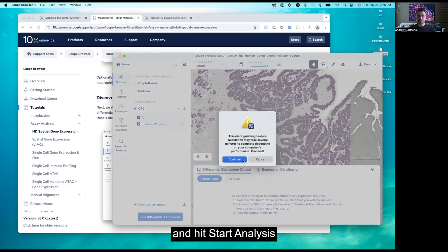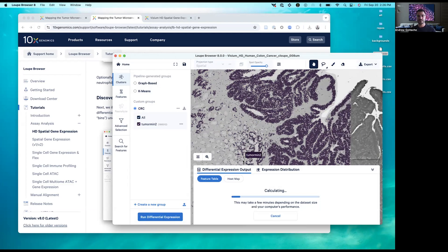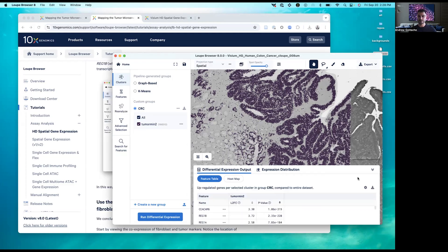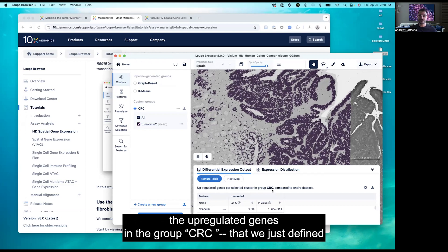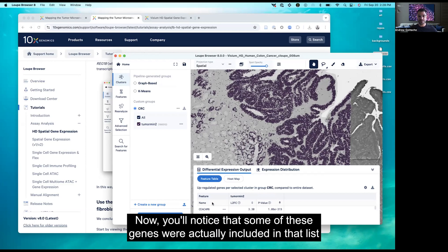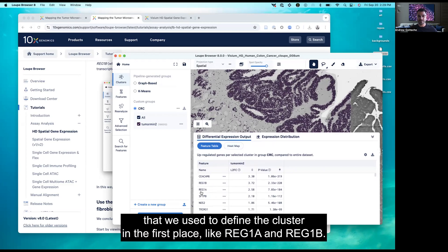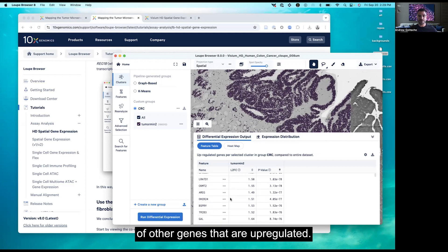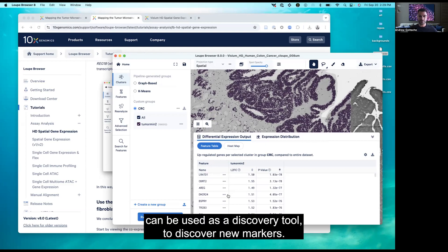This may take a few minutes depending on dataset size and your computer's performance. Our analysis just finished. Now we can see the upregulated genes in the CRC group we defined, based on tumor marker genes compared to the entire dataset. Some genes — like REG1A and REG1B — were included in the list used to define the cluster, but you can also see a large variety of other upregulated genes. In this way, Visium HD, with the power of the whole transcriptome, can be used as a discovery tool to find new markers.